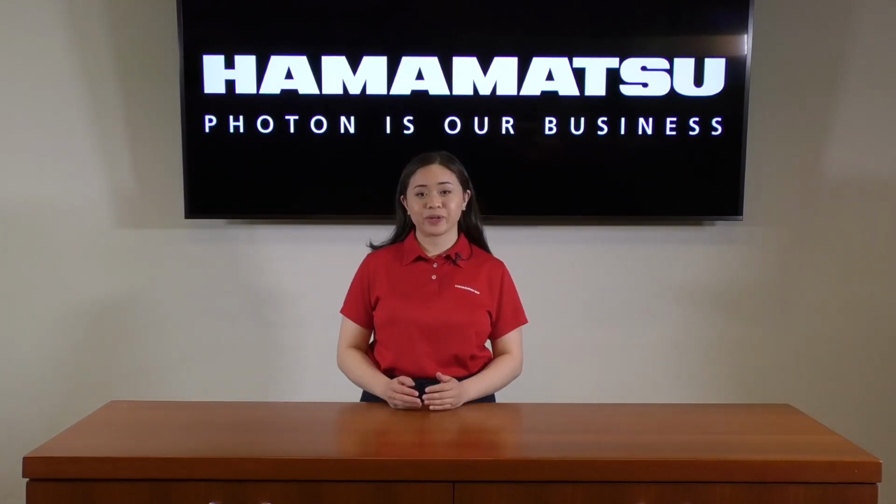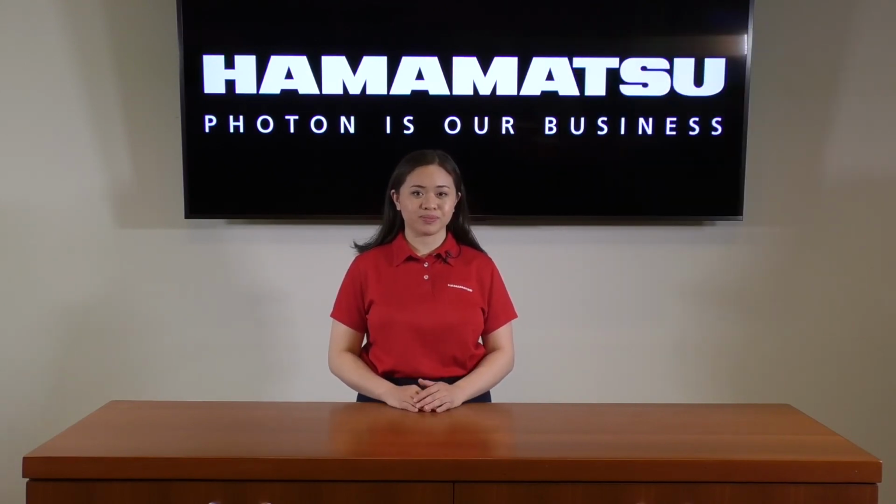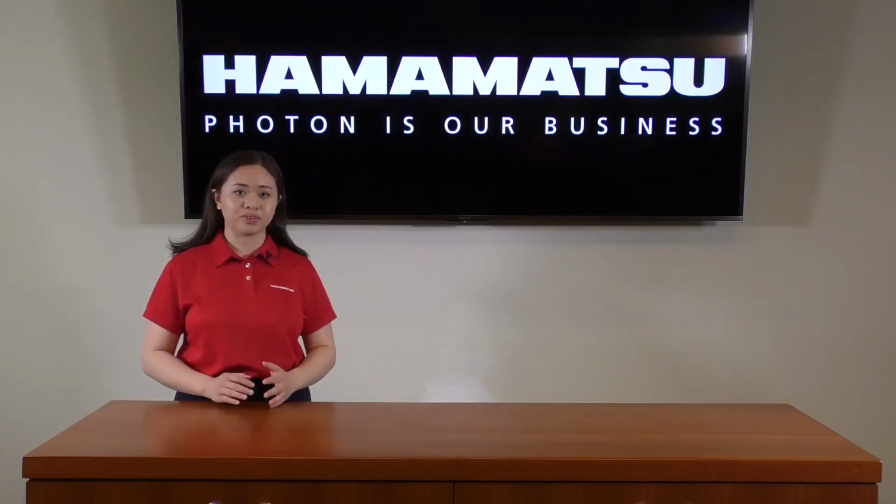The next spectrometer tested is the MEMS-FPI module. This module uses a different interferometer design, a Fabry-Perot interferometer. This interferometer consists of a tunable filter made up of upper and lower mirrors, whose distance apart defines which wavelengths of light in the NIR are transmitted through the filter and to the InGaAs pin photodiode.